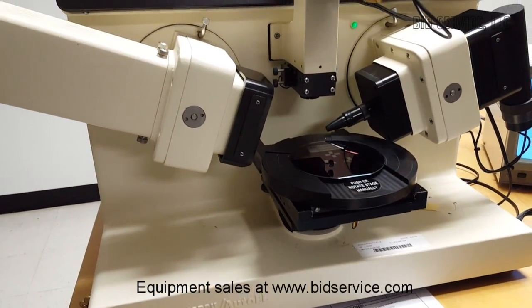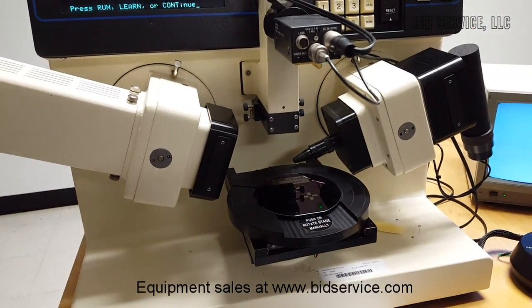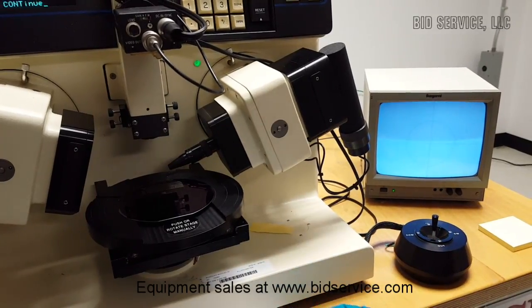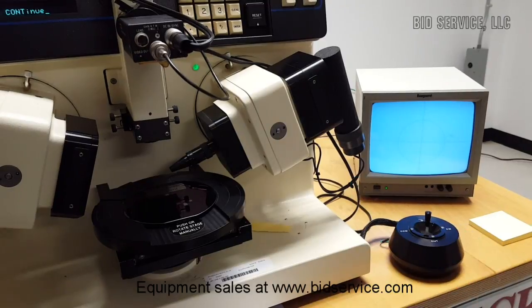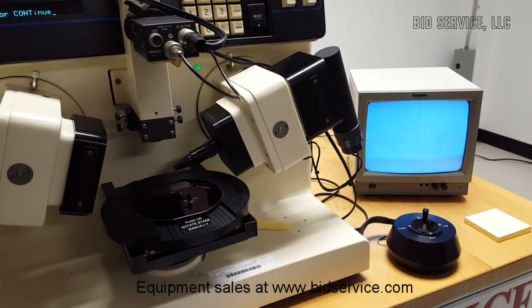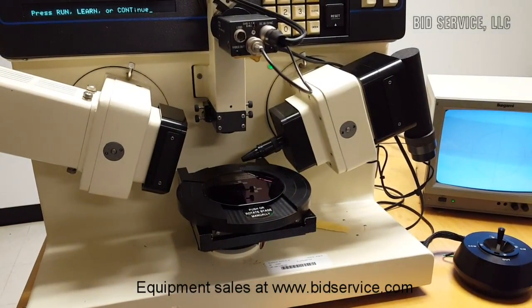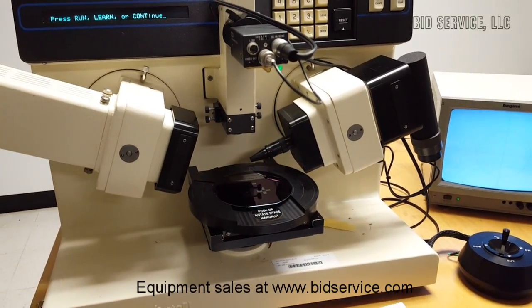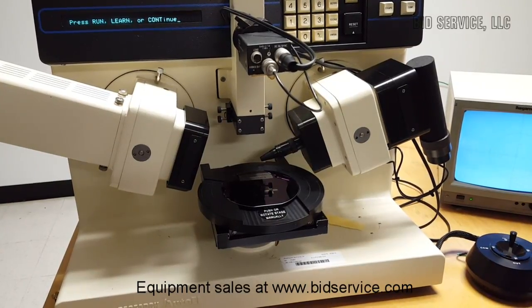A detailed user manual will be included with the machine, and only trained personnel should operate this system. And before operating the machine, certain things are to be kept in mind. That is, the approximate thickness of the film should be entered, because the ellipsometry measurements are made in steps of certain thickness levels.